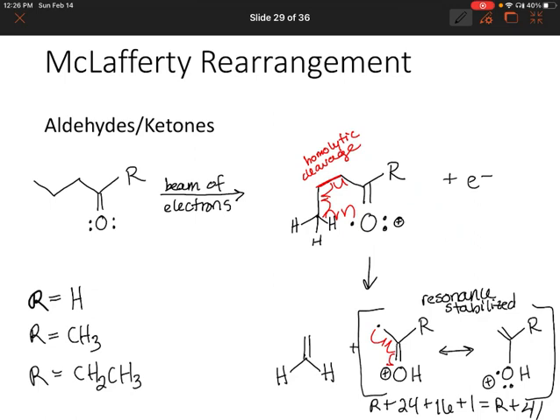Oh, sorry, I'm missing a couple hydrogens. Oh, wait, I'll just edit that.